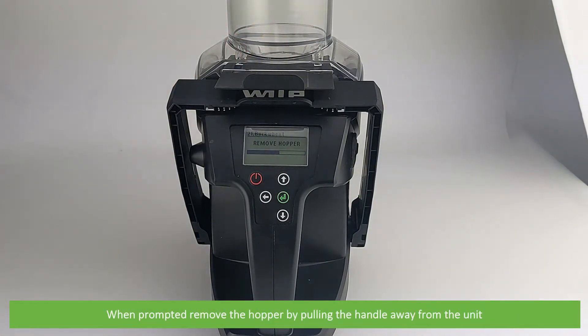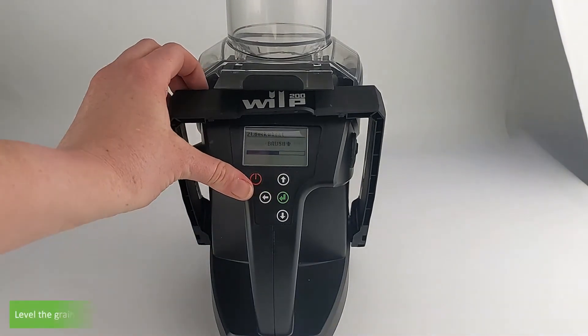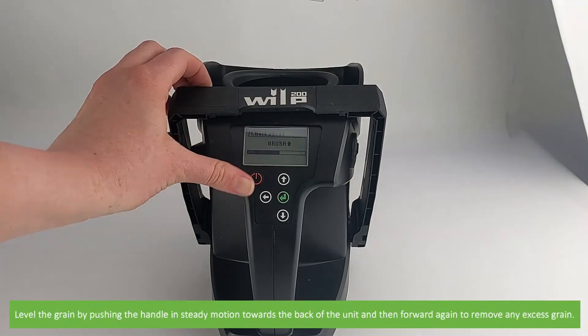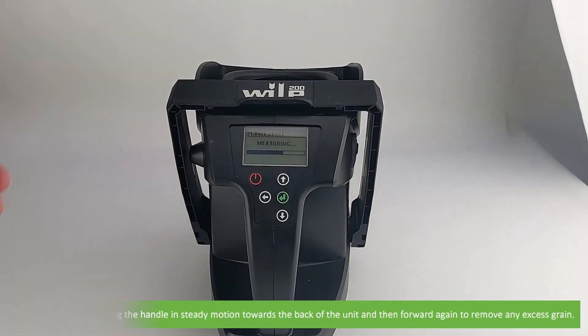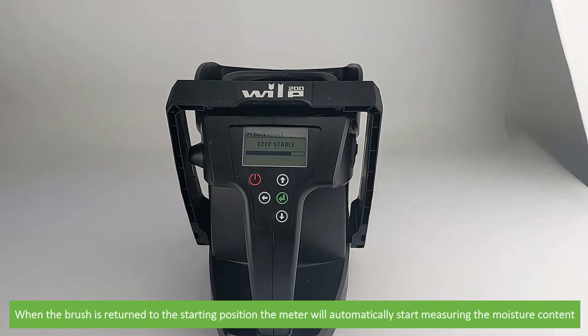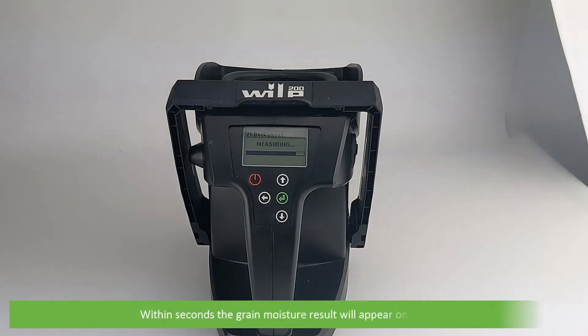When prompted, remove the hopper by pulling the handle away from the unit. Level the grain by pushing the handle in a steady motion towards the back of the unit and then forward to remove the excess grain. Once the brush is returned to the starting position, the meter will automatically start measuring the moisture content. Within seconds the grain moisture result will appear on the LCD.